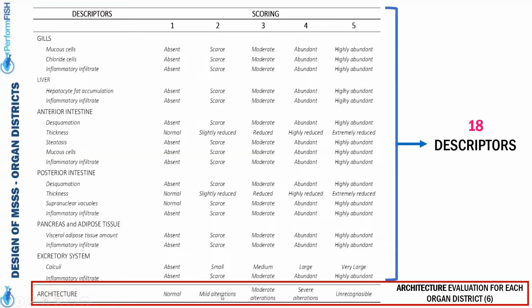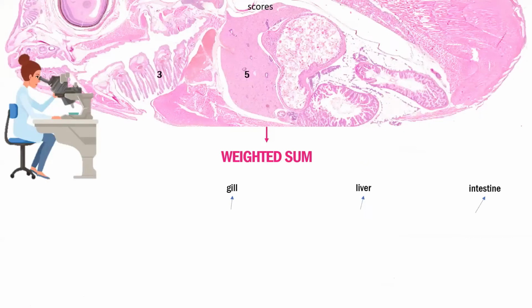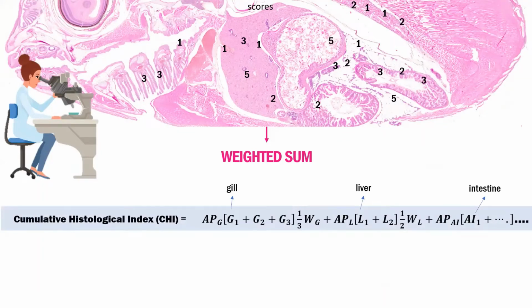And so, doing a quick calculation, it turns out that for each batch, 24 data are obtainable. So that is a huge quantity of data, especially thinking that 20 fish per batch were evaluated. And so the scoring system of the descriptor was defined and put to the test. Our main goal was to provide results that would be transferable and immediate even for non-experts.